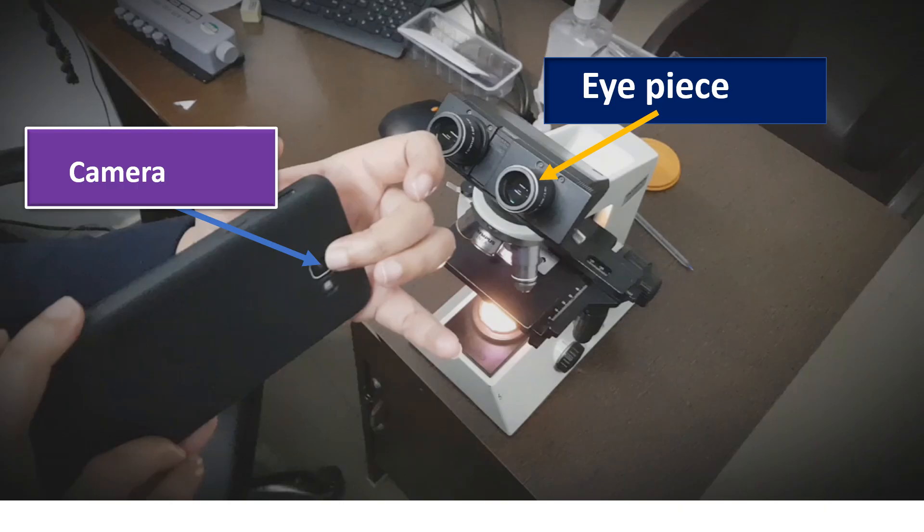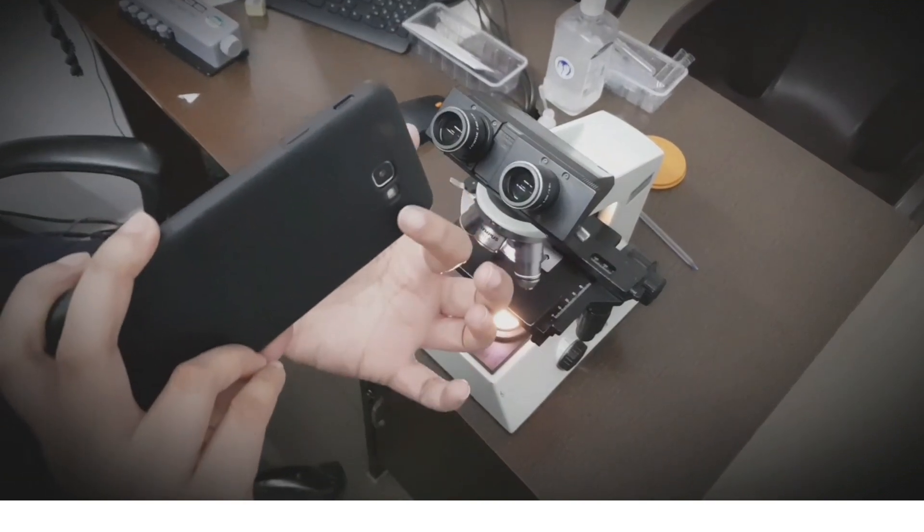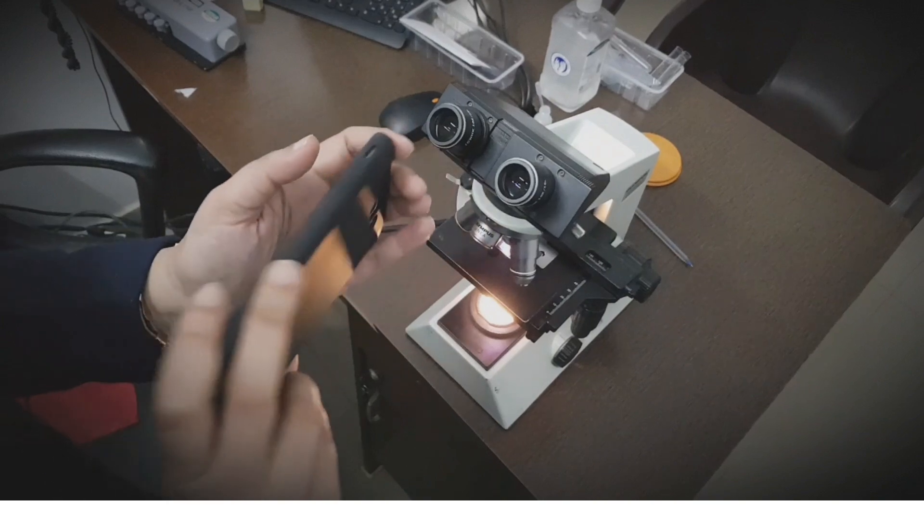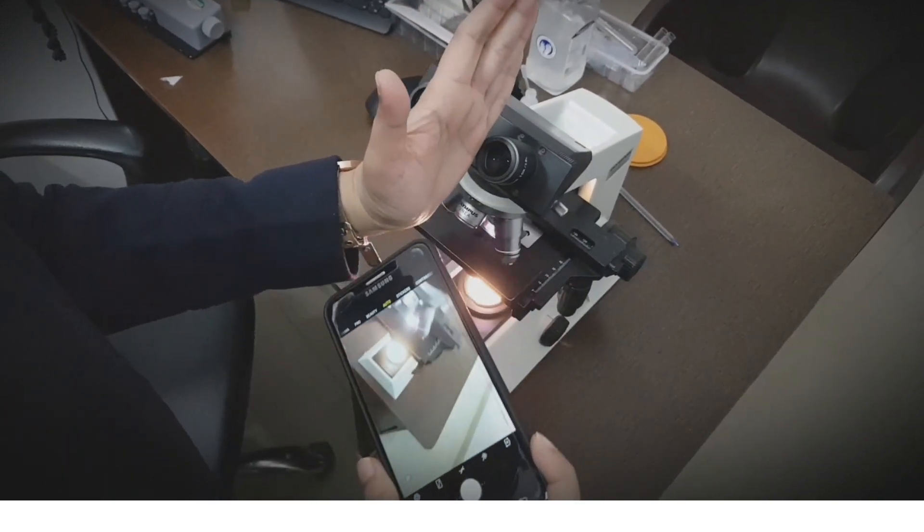So let's begin. This is the aperture of your camera and the eyepiece on which it has to be focused. Hold the phone horizontally with both hands. Use the palm or finger of both hands to support the phone.